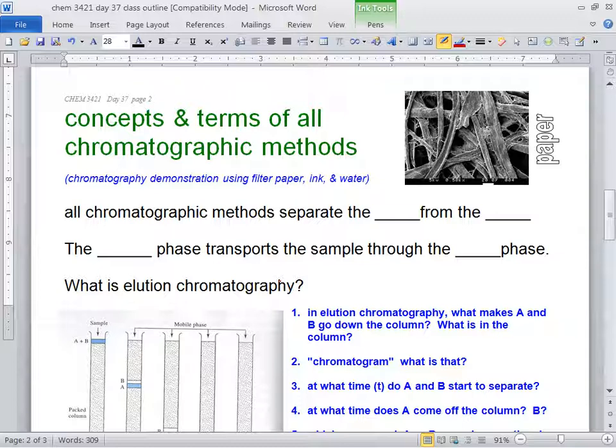So let's say something in these vis-a-vis markers is making Naya sick, right? And it's the green ones. Every time she gets the green mark on her, it's all rashy or whatever, right? So let's do some chromatography. Let's separate out all the different components. So that's what I did on here.